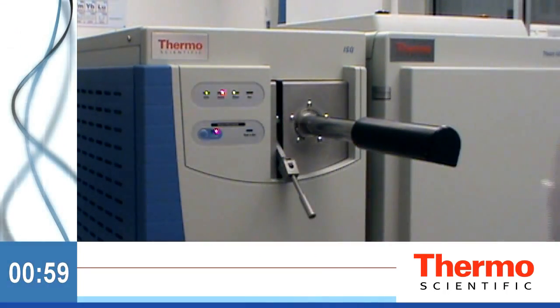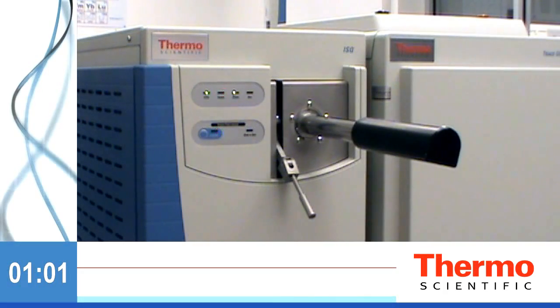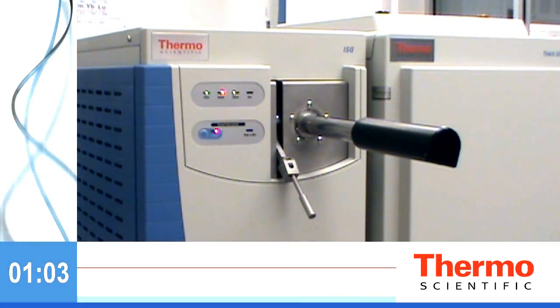Evacuate the air between the tool and the valve. Using this source exchange process also gives you the unique ability to change ionization modes without venting the system. Optimize performance in EI and CI without compromising productivity.